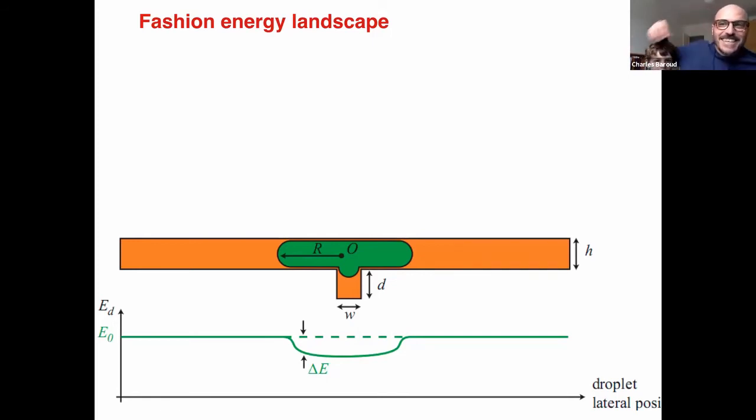So now we can take a droplet and have it confined everywhere, except locally inside of the little groove that can reduce some of its confinement.